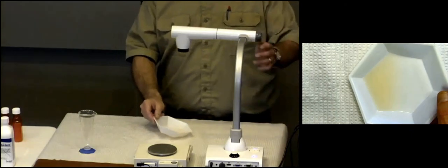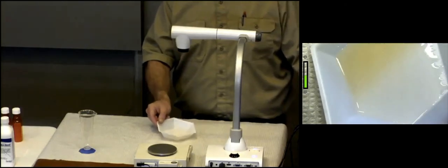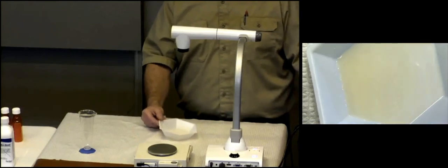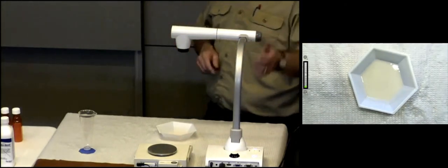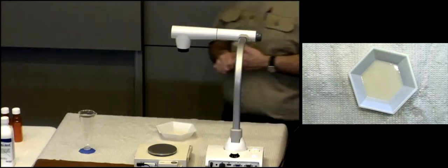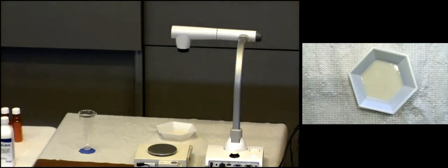Are there any visible clumps in there? Because we're going to talk about the biggest thing. Remember how we said the whole point of wetting the powder was to avoid what? The powder clumps. So I would say after suspension, say with no visible clumps and easily redispersible. That's describing the suspension with all of the properties we described on the first slide. So it should say off-white, fruity smelling, opaque, viscous suspension with no visible clumps and easily redispersible. Rolls right off the tongue, right? And you're going to have to remember that for the test, kind of. So you're just going to be aware of that. So we want to make sure you have all of those steps down.